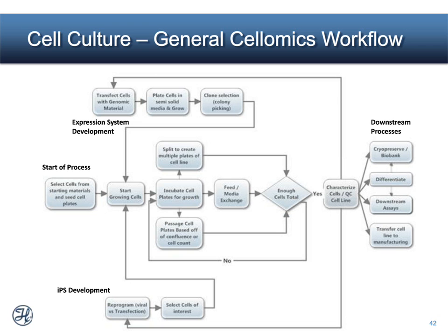Endpoints of cell culture and maintenance on an automated system would be doing preparation of assay-ready plates, such as those for differentiation protocols or some kind of cell-based assay for quantitating protein expression, or transferring those cell lines to manufacturing.